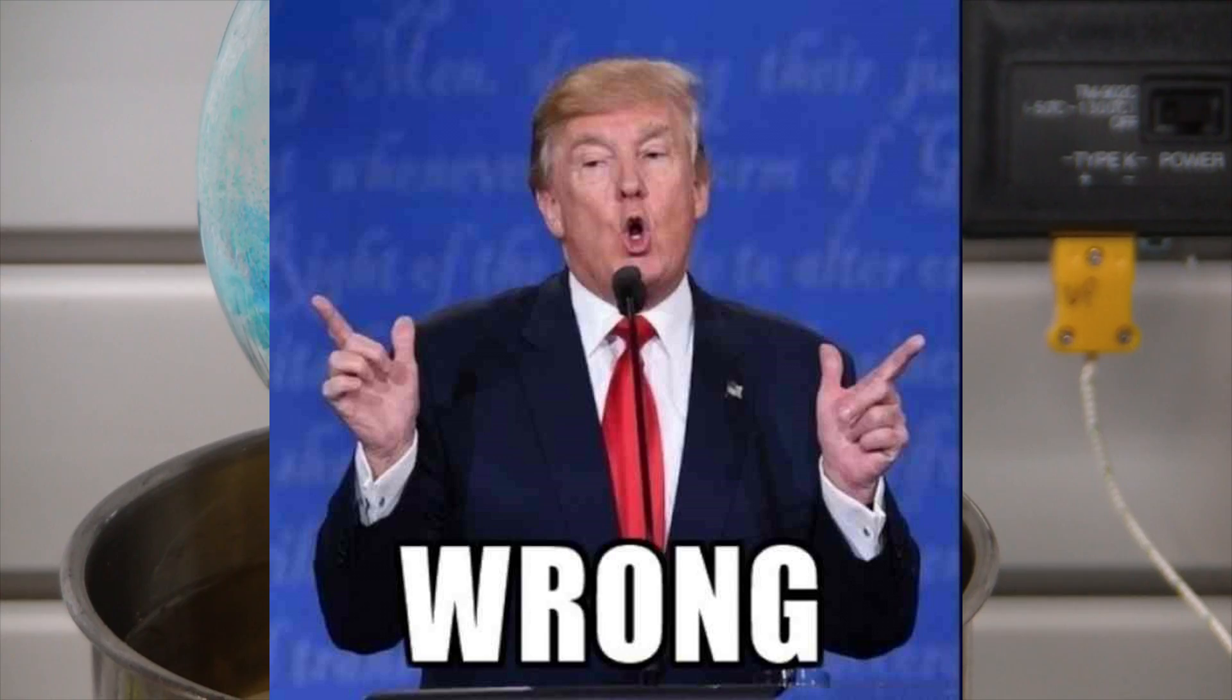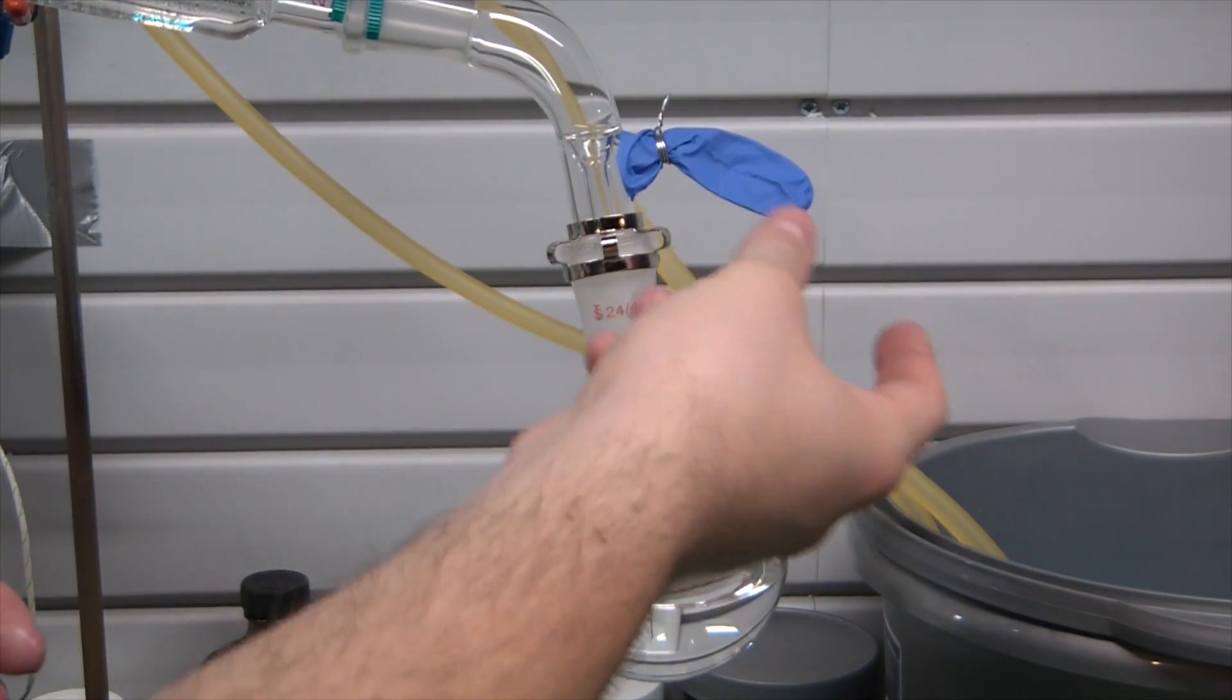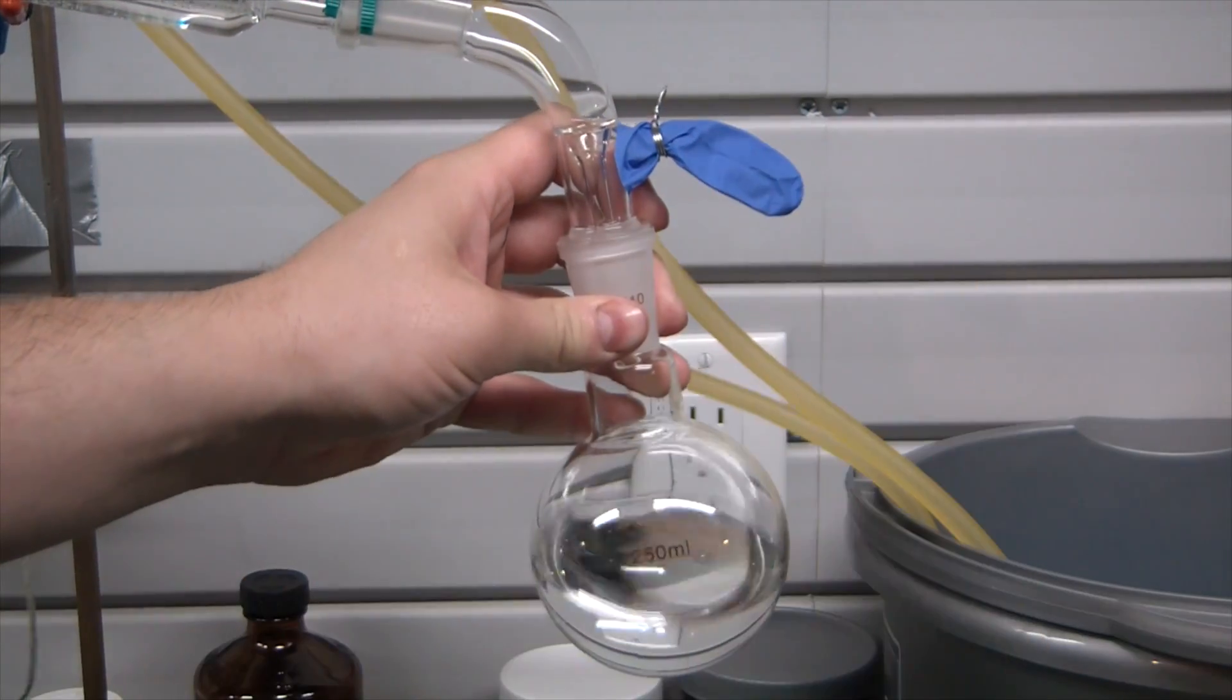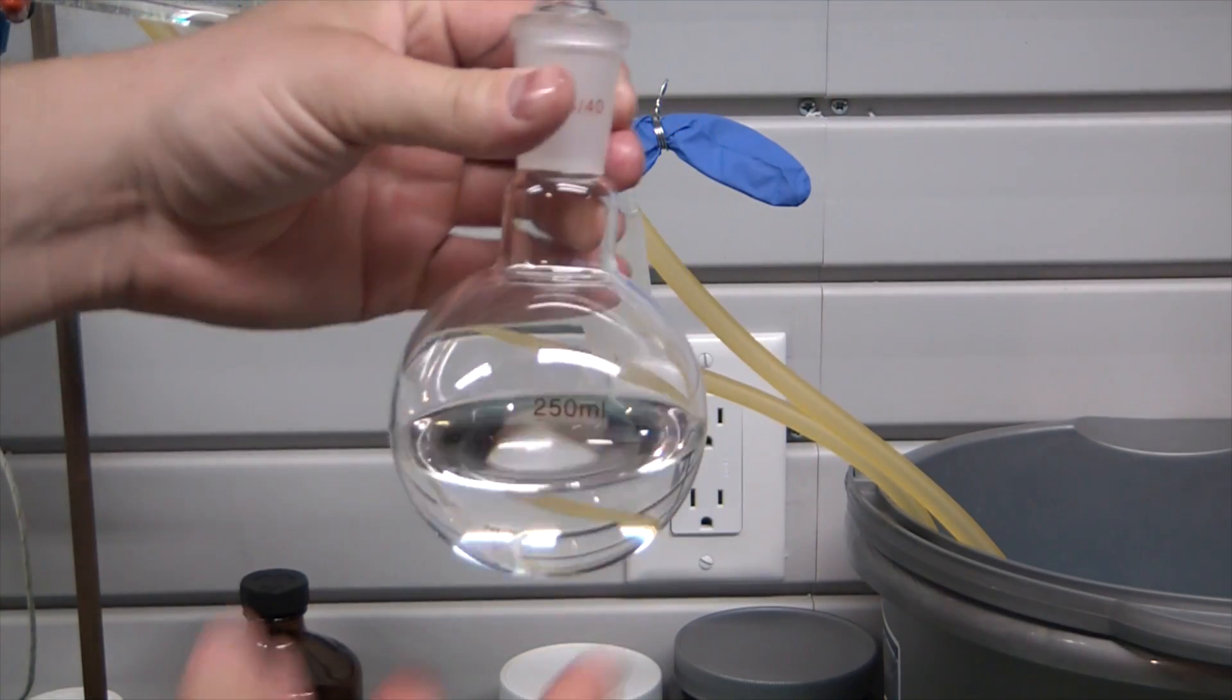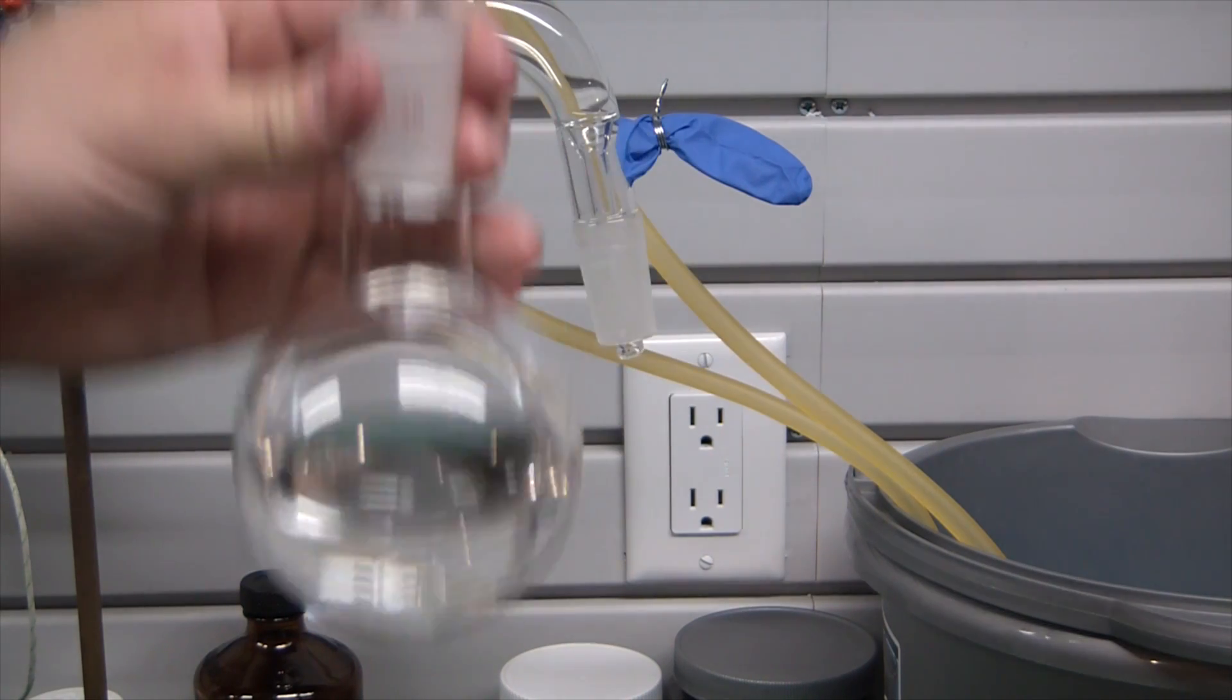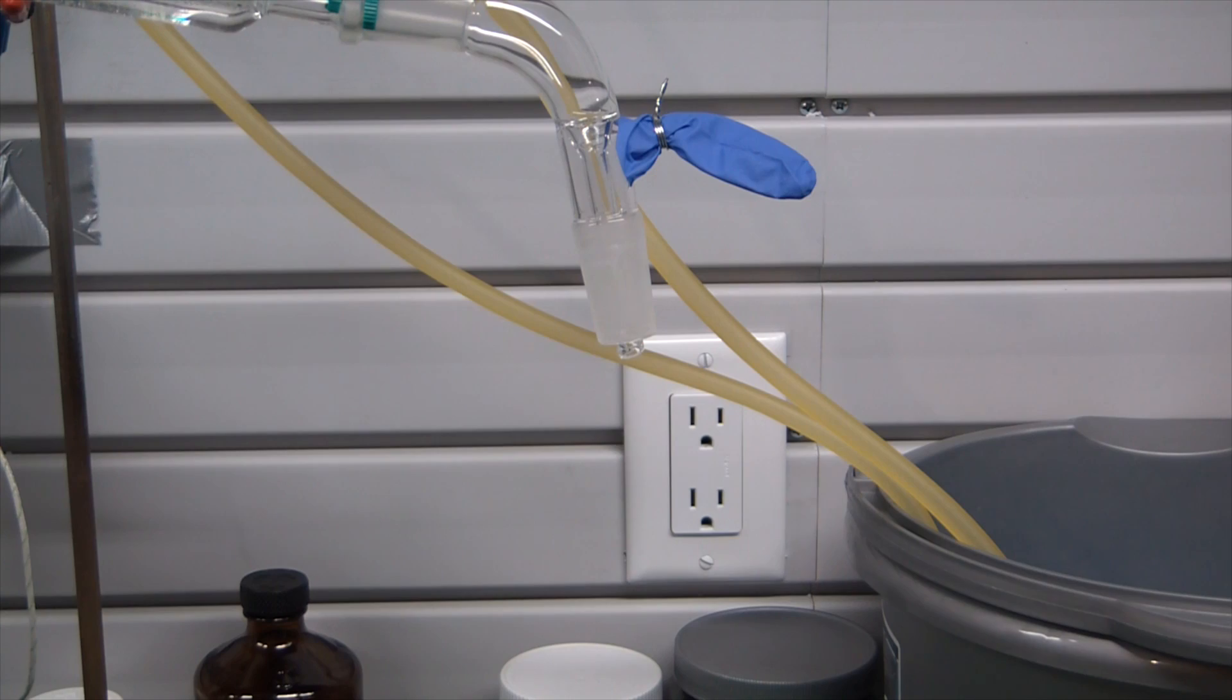So as soon as we remove it, you can see this nitrile glove kind of sucked in, which means we got to stop atmosphere from getting in there. And there we go, that is our beautiful anhydrous ethanol. So I'm curious to see what kind of purity we got. Hopefully it's at a hundred.